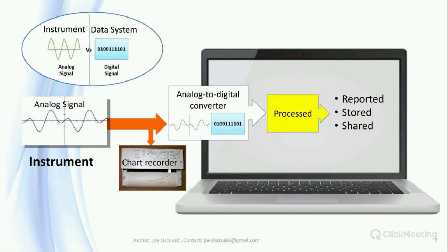As we'll see in the next few slides, it's possible to distort the appearance of the instrument data by using settings that are not suitable for the analysis that's taking place. Whenever possible, the converted data should be, at least during the method and instrument qualification validation process, compared against the original analog instrument output to ensure that the converted data is a faithful representation of the instrument-generated signal.